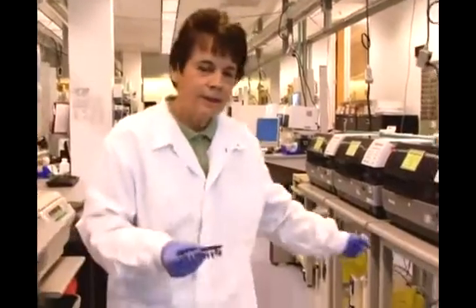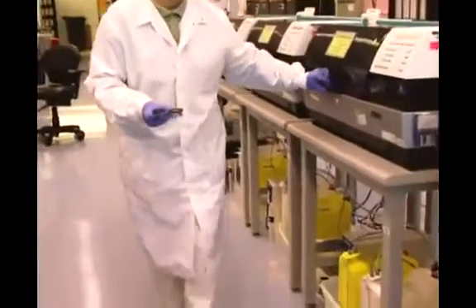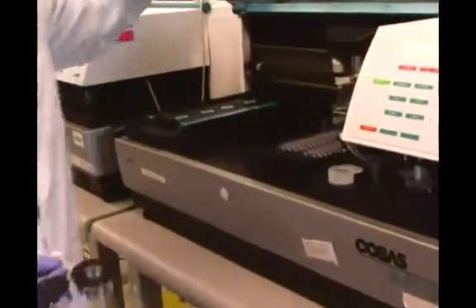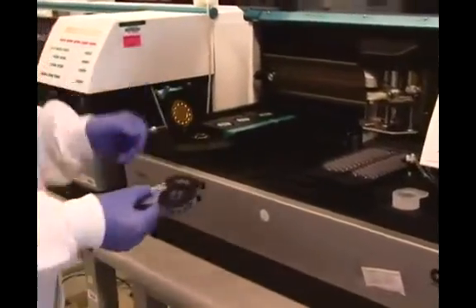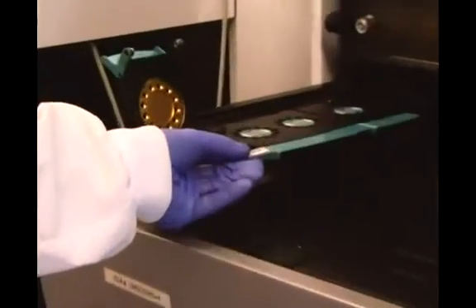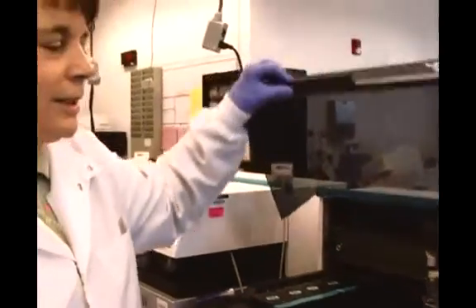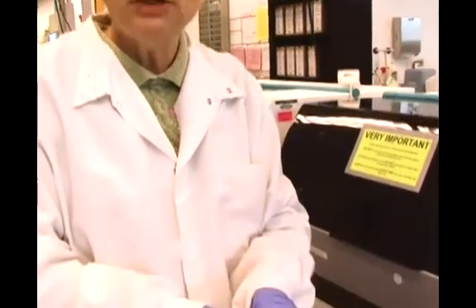And then we're going to put this A-ring into this instrument here that amplifies and detects it. So it opens up here and this A-ring actually sits right into the instrument. It's a thermal cycle instrument. We close it, and it's going to alternate temperatures, and it's going to take that little DNA and stretch it and multiply the copies about a million times.